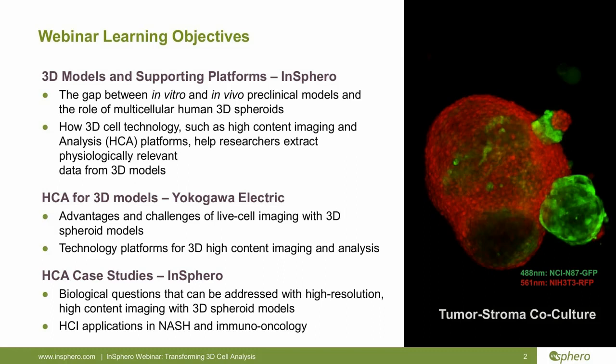My co-presenter Gerd will discuss some of the special hardware and software considerations for 3D imaging and how Yokogawa is tackling 3D imaging challenges. We will then conclude the webinar with 2 case studies highlighting a few of the cell-level biological questions that can be addressed in multicellular spheroid models using high-resolution imaging and analysis approaches.